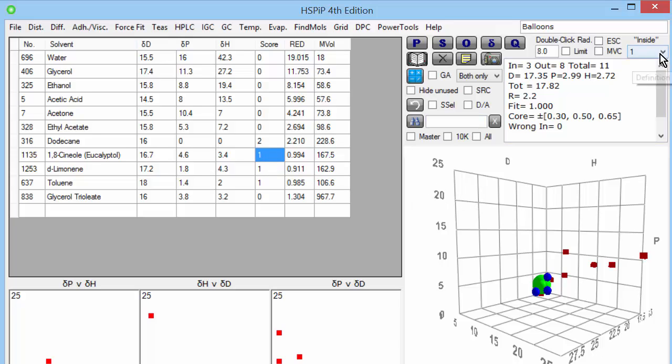But if I say that twos are also acceptable and refit, then I get a different sphere. Clearly it's bigger because I've relaxed the criteria. I'm accepting not very good solvents. And the result hasn't changed too much. The DH has gone down a bit. So we now know that the HSP of polyisoprene is somewhere between the really good results and the not so good results.